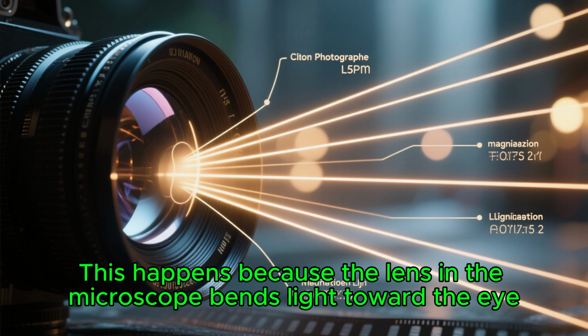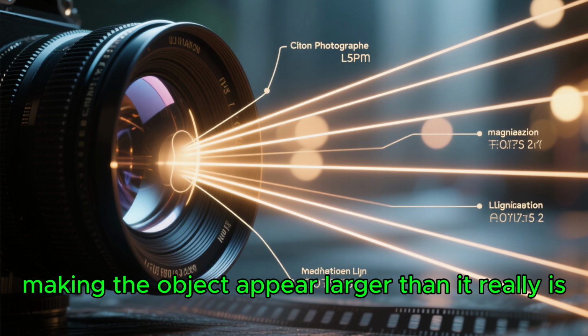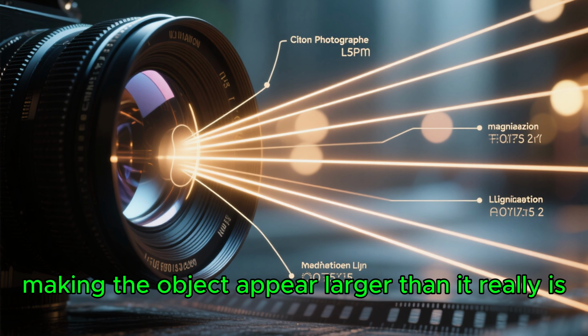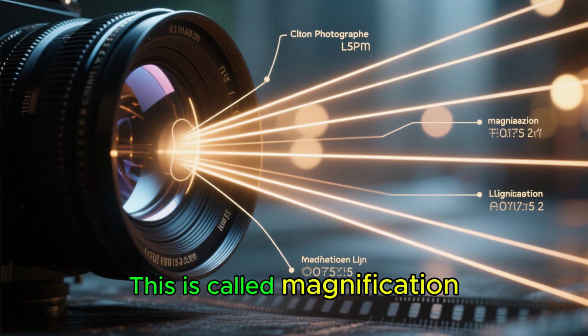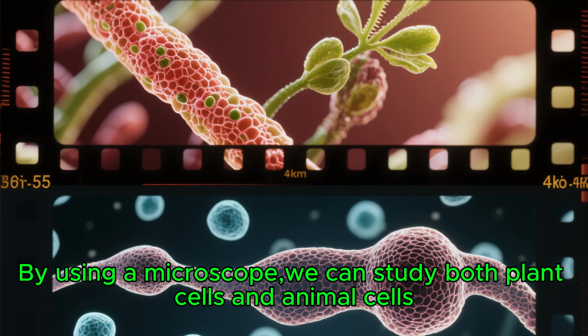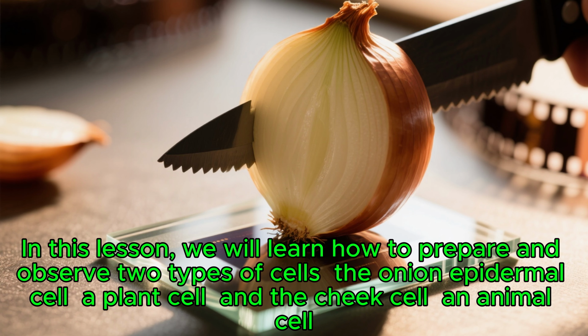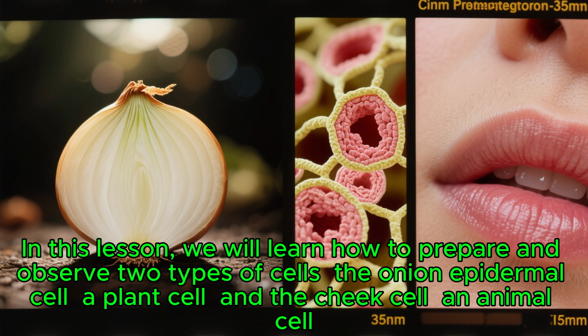This happens because the lens in the microscope bends light toward the eye, making the object appear larger than it really is. This is called magnification. By using a microscope, we can study both plant cells and animal cells. In this lesson, we will learn how to prepare and observe two types of cells: the onion epidermal cell, a plant cell, and the cheek cell, an animal cell.